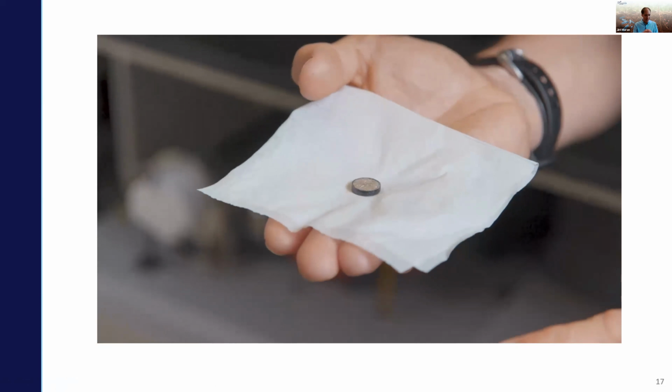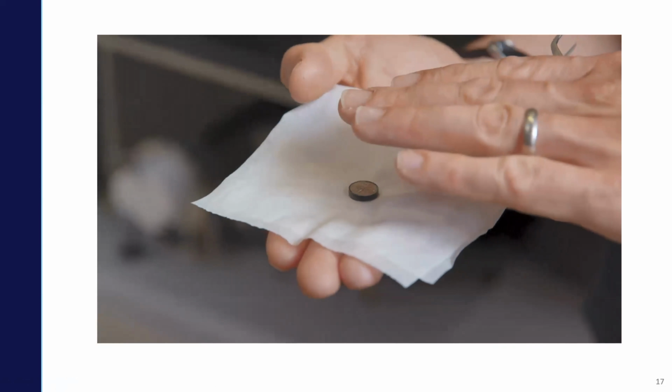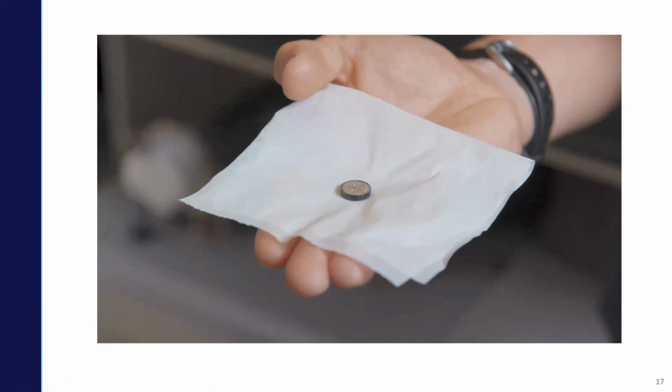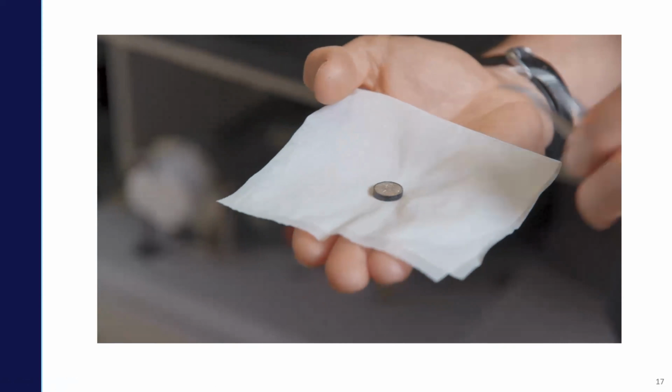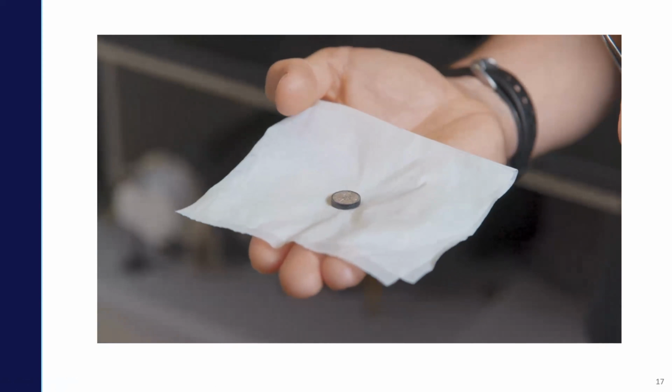Took a very thin soil core from that rhizobox going in. Is it working? Yeah, in this case, the z-axis of the sample to flatten out the surface. But this retains the two-dimensional spatial resolution of the sample. So we haven't altered the two-dimensional spatial components here. We then dried the sample in a freeze dryer, and that's it.